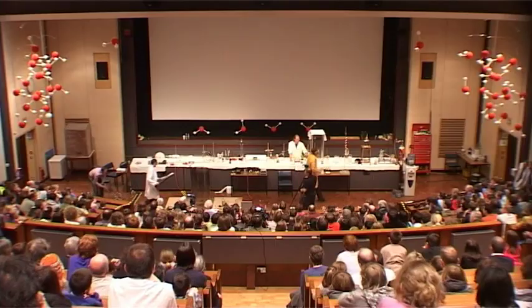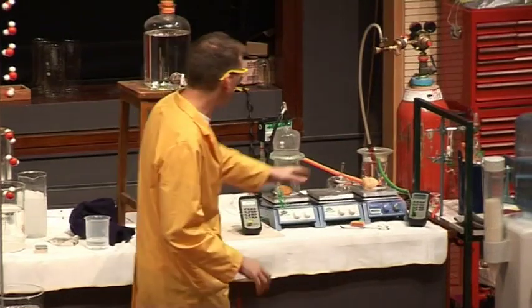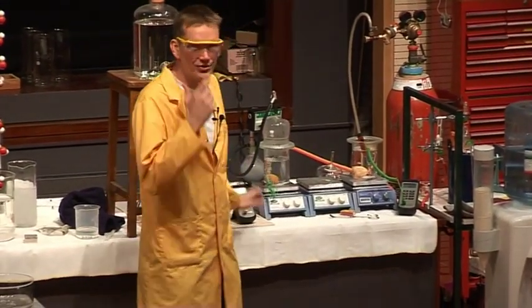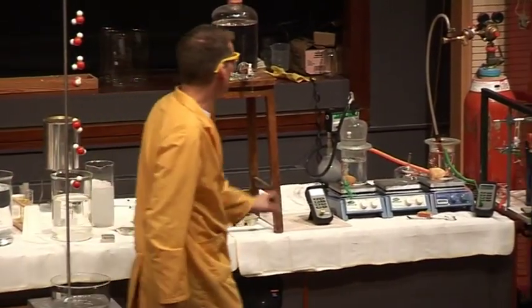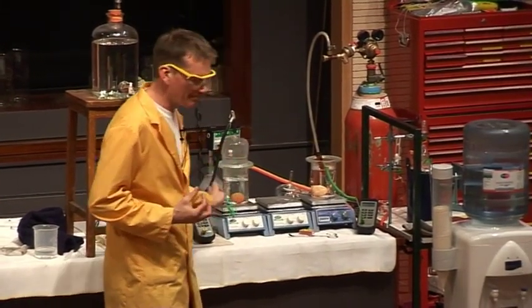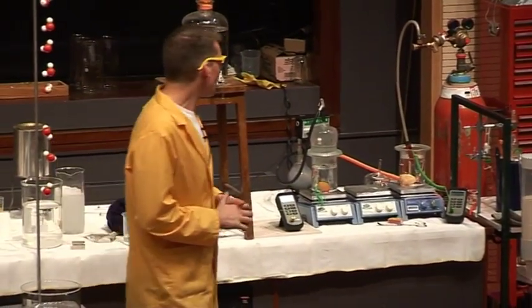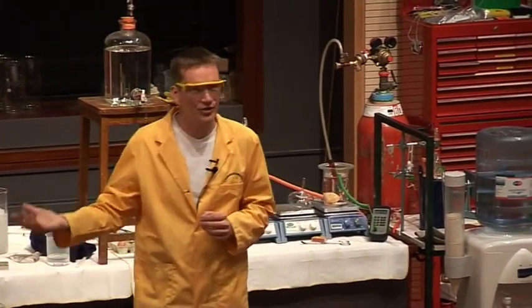Now then, back to this water. So water normally boils at 100. This water is boiling at 100, but this water is boiling at, well, it's at 71 degrees C. This is because, well, what we've done here, we put a lid on this, and we've taken some of the air away from this space here. So we've reduced the air pressure. And actually, we've reduced the air pressure to the same as it would be on the top of Mount Everest.